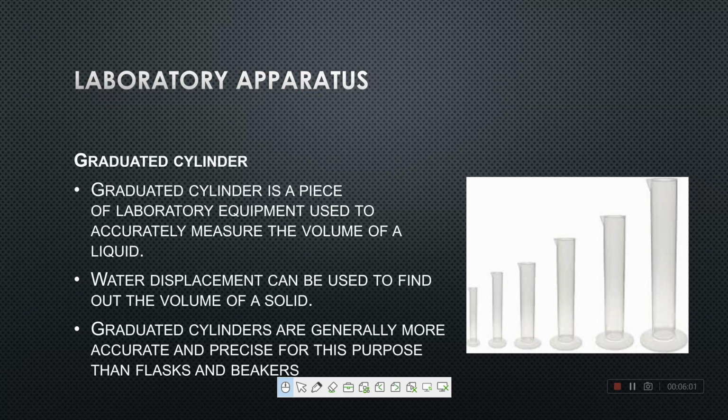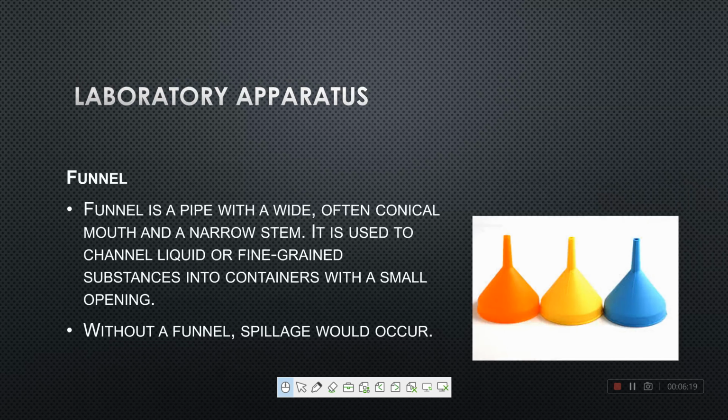So suppose we have to make a solution of different concentration, then we measure the solution in this graduated cylinder. Water displacement can be used to find out the volume of a solid. These are generally more accurate and precise for this purpose than flasks and beakers.